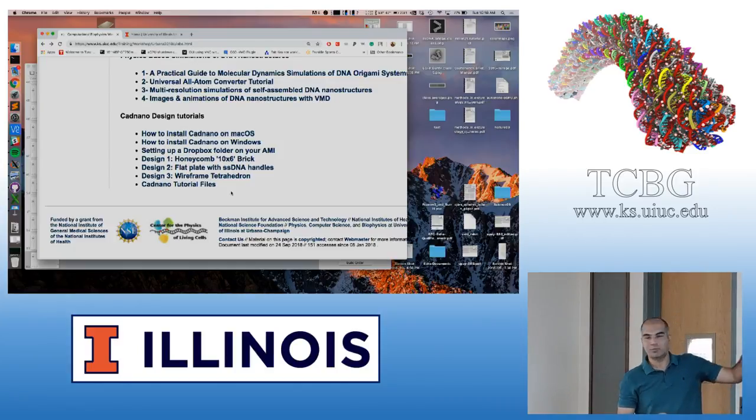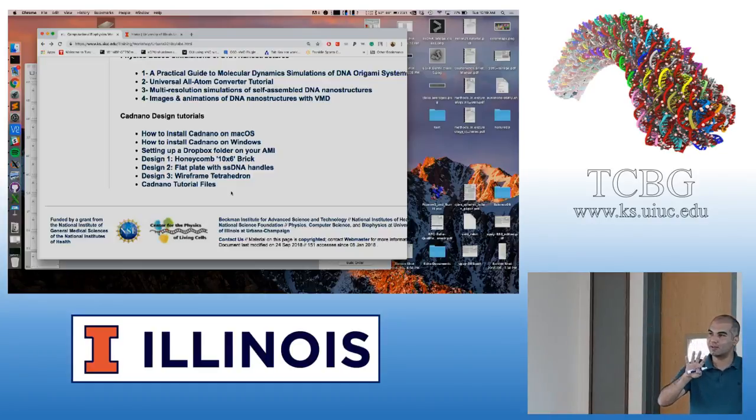So let's say you made an auto break, but then all the colors are color coded based on the TM values of those oligos. If this is ready for order, I would color them according to how you want. But you might want to color different regions separately. And then let's say if you have one design, you can just try export oligos.